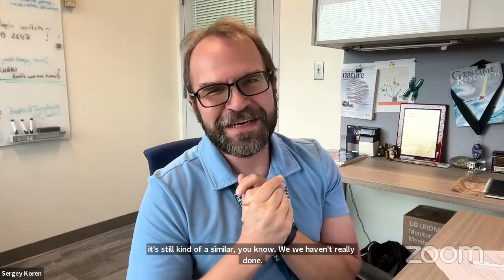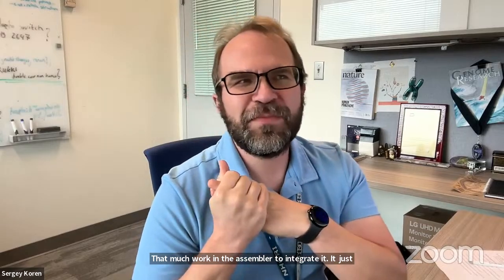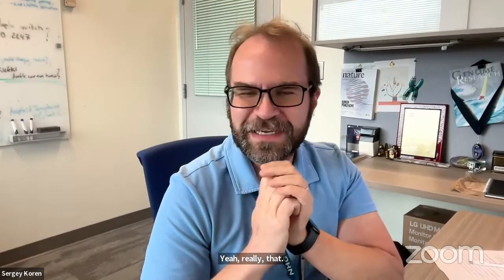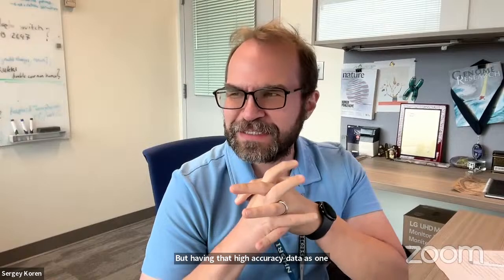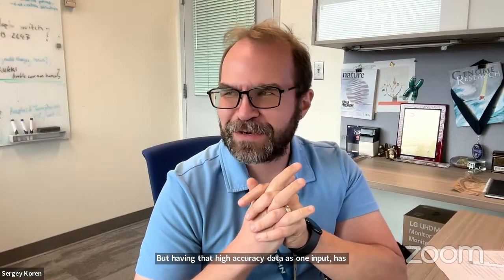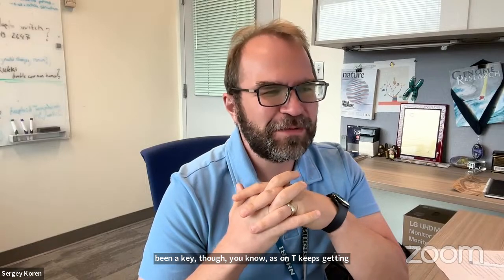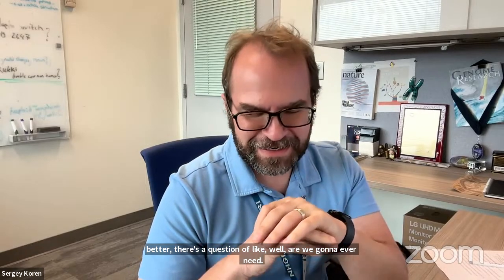It just is a drop in. But really having that high accuracy data as one input has been key, though as ONT keeps getting better, there's a question of whether we are ever going to need it at all. Maybe we just don't need the high accuracy data.